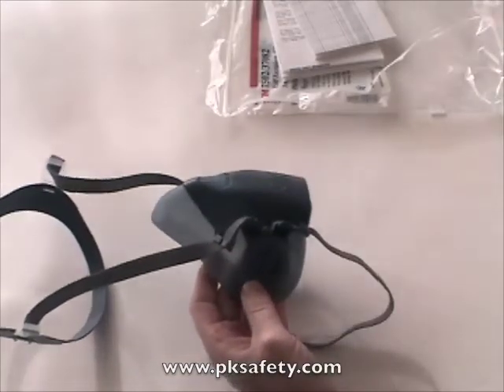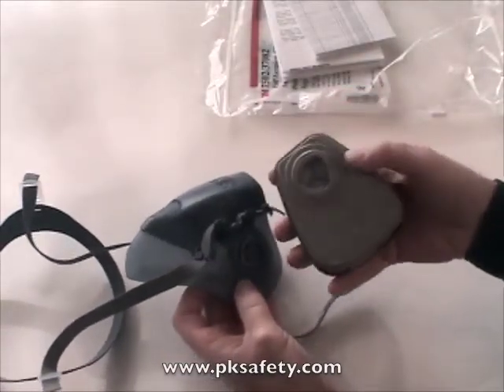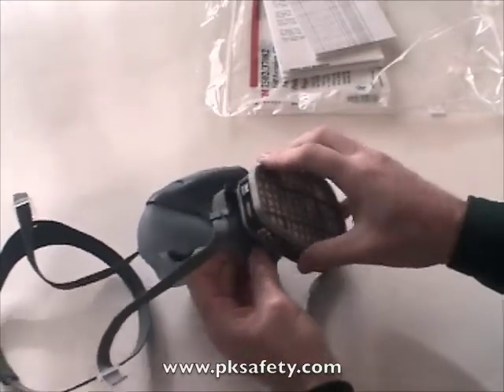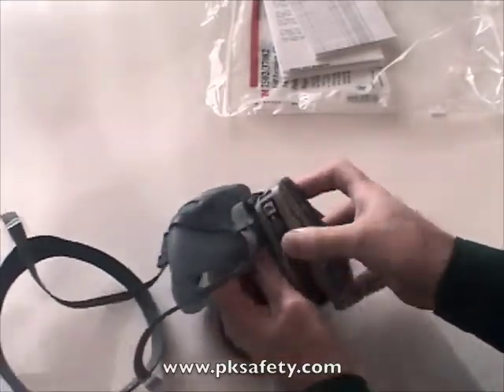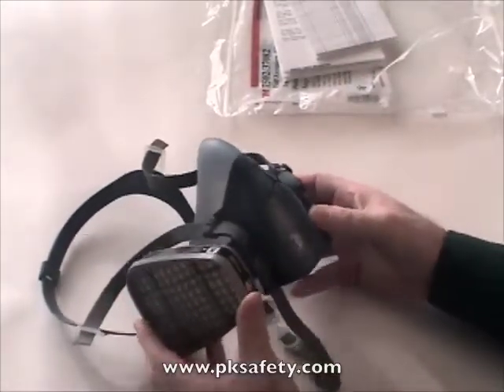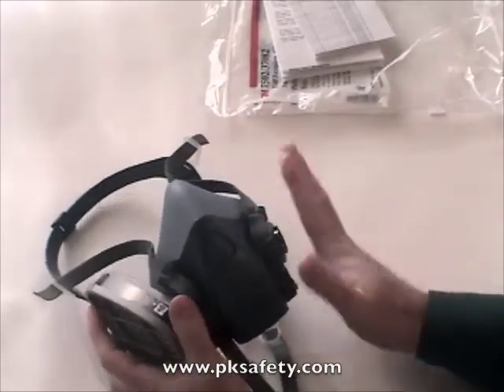The cartridges — I'll grab a 3M 6001 right here — have a bayonet connector that matches up on your mask. You just put it on and give it a turn. You can hear it click, and now the cartridge is on the mask. There are two of them, one on each side.